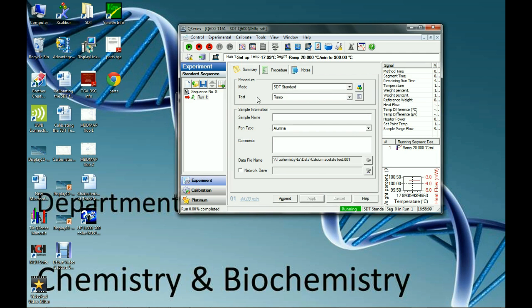So in the background, you might be able to hear the TGA firing up. Once that's done, we can go ahead and look at the data.